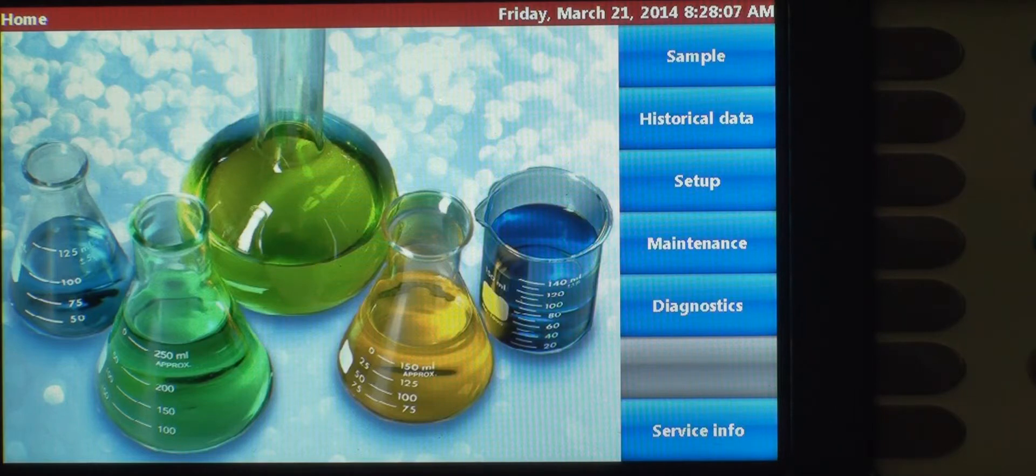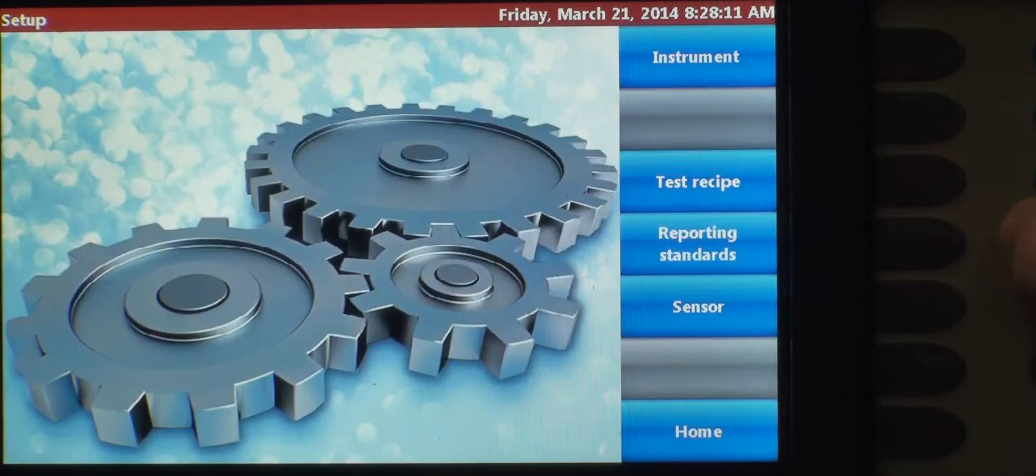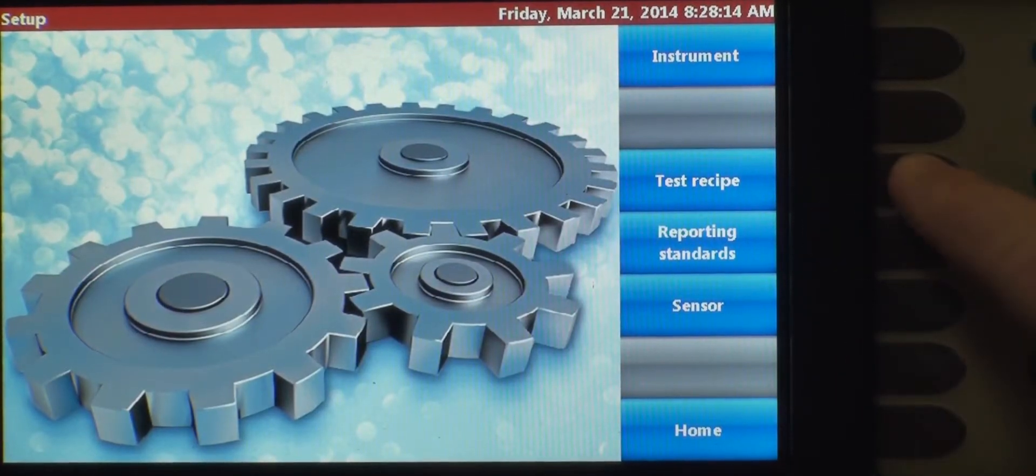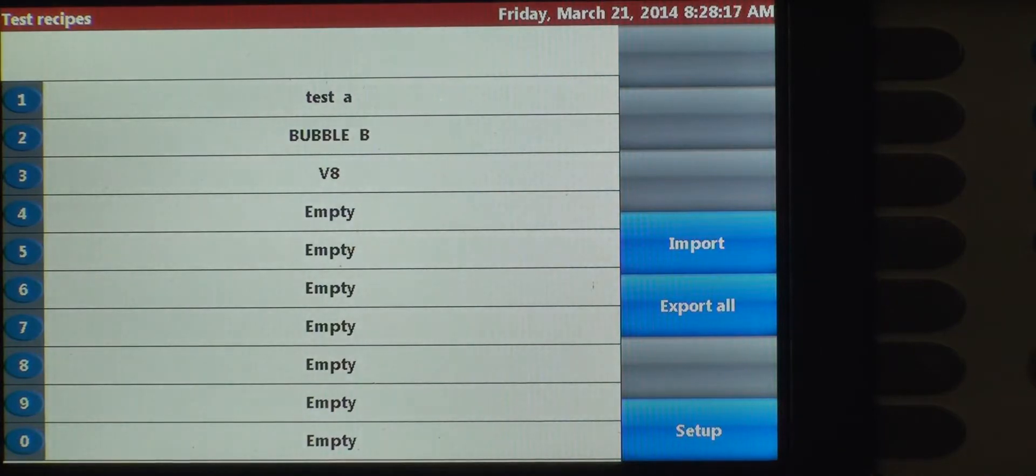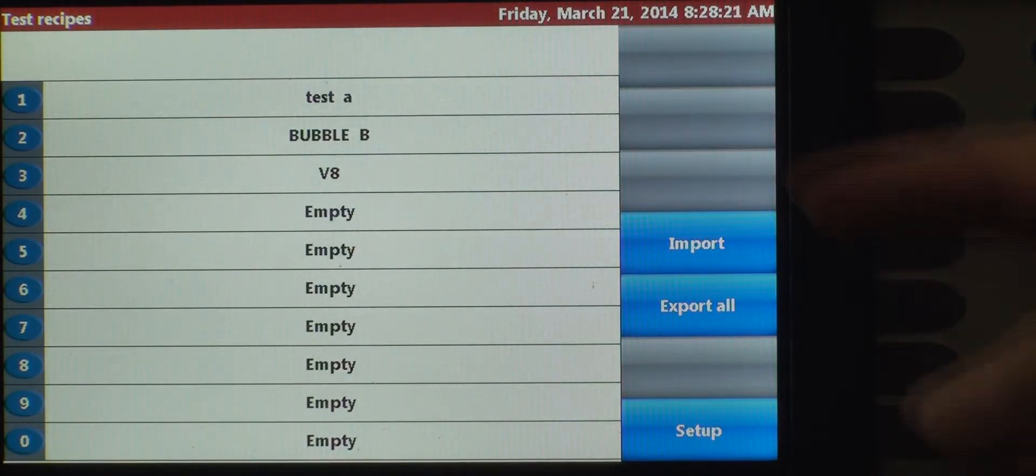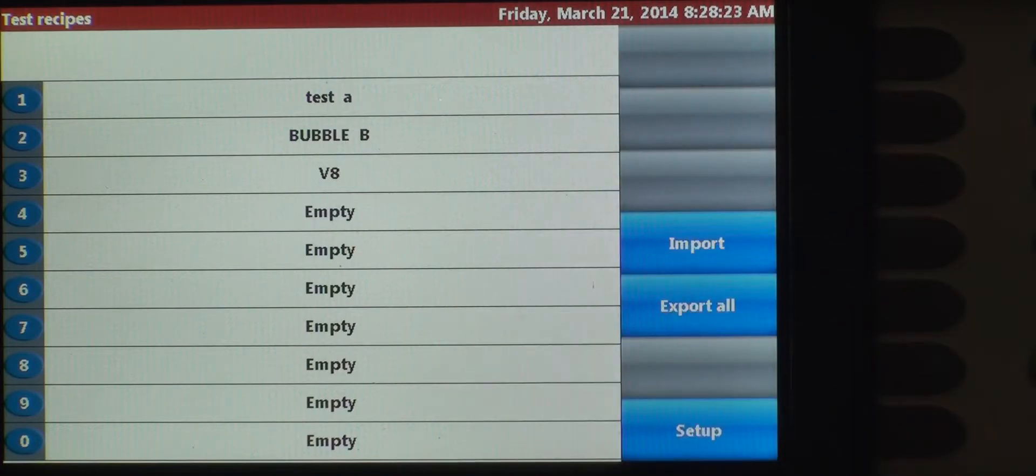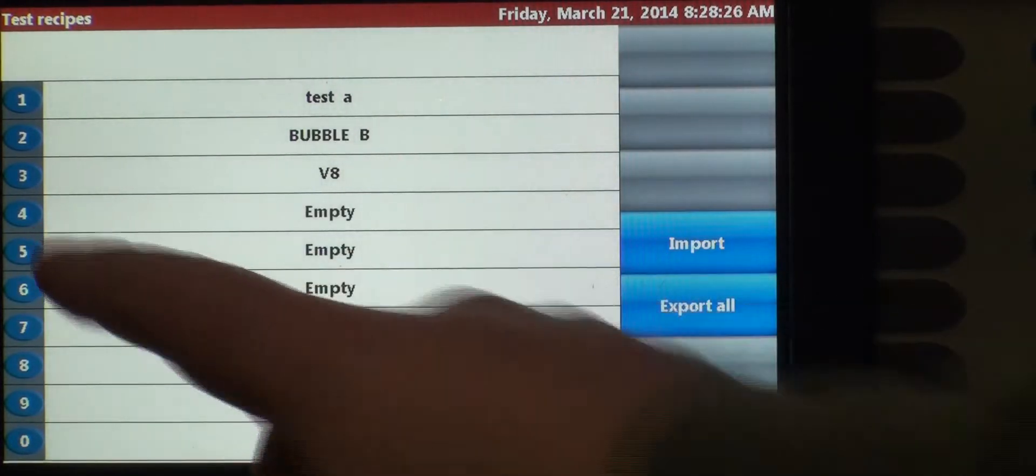This is the home screen. We're going to go to Setup, and then we're going to create a test recipe right here. You can create up to 20 custom recipes on the 8011+. We've already created three, so for the purposes of this demonstration, we're going to create a recipe here on number four.